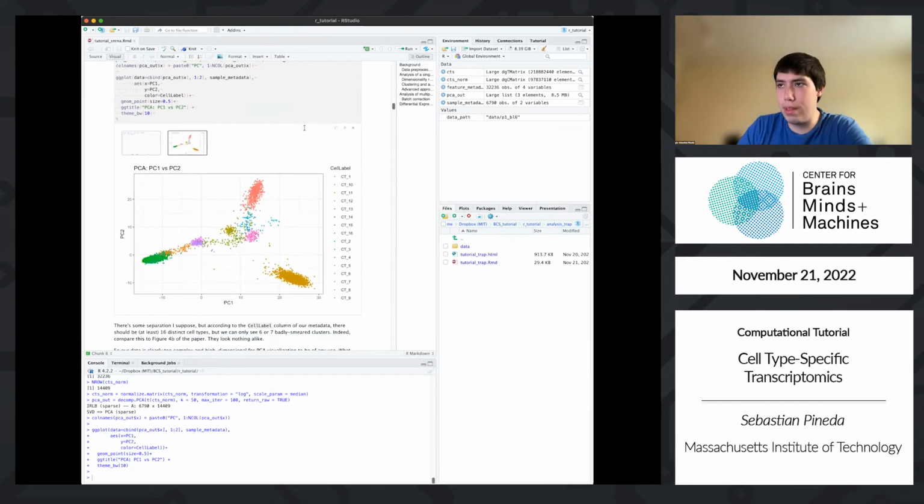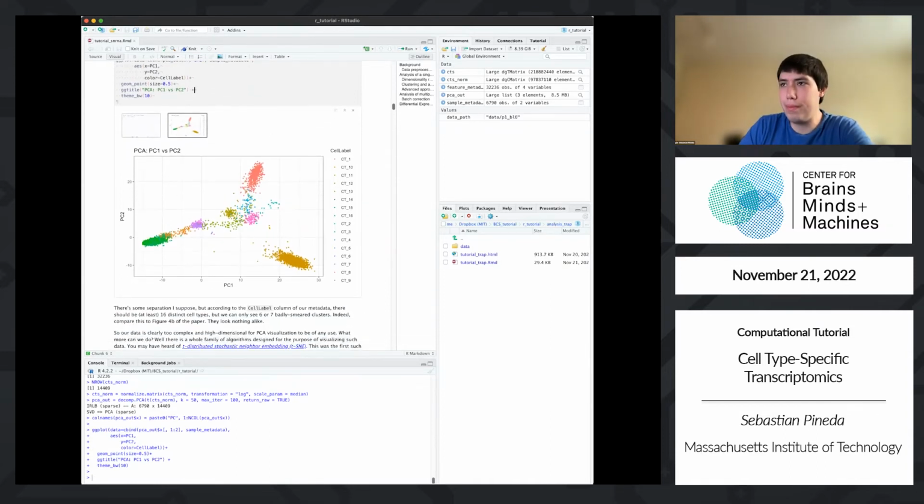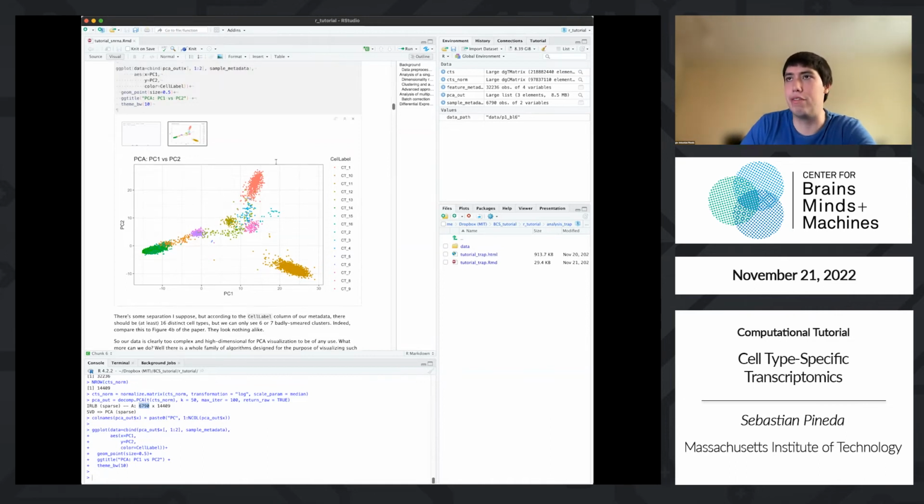Okay. So we have more than 8 points this time. Specifically, we have 6,790 cells. These are from one mouse and 14,000 genes that we've reduced to 50 dimensions by PCA, and we plotted them out. And now I already cleaned this data. I already annotated this data. I know what's in it.